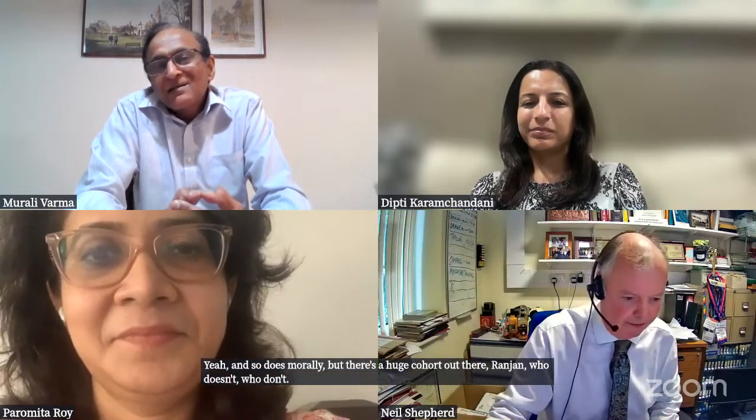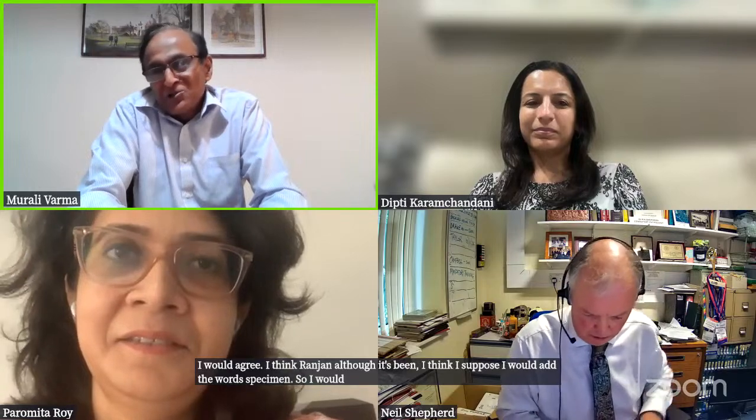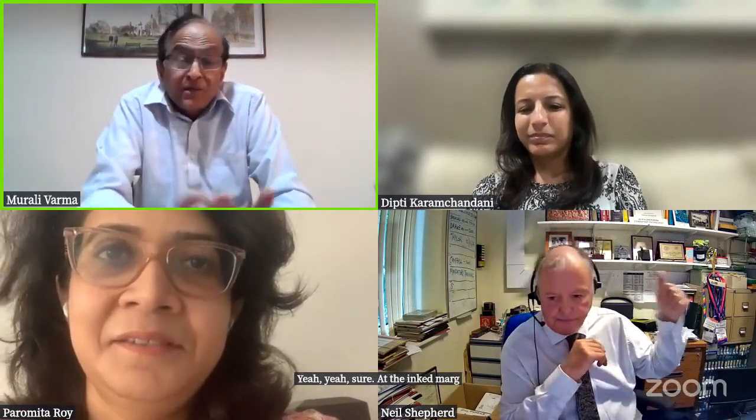Enough said. I think, Ranjan, the only bit I would add is the word specimen. So I would say at the specimen margin. Yeah, sure. At the inked margin of the specimen. I would say at the inked specimen margin. Correct. Because I can never be sure whether that is the true resection margin. Sure. No, I think margin, obviously, of the specimen.